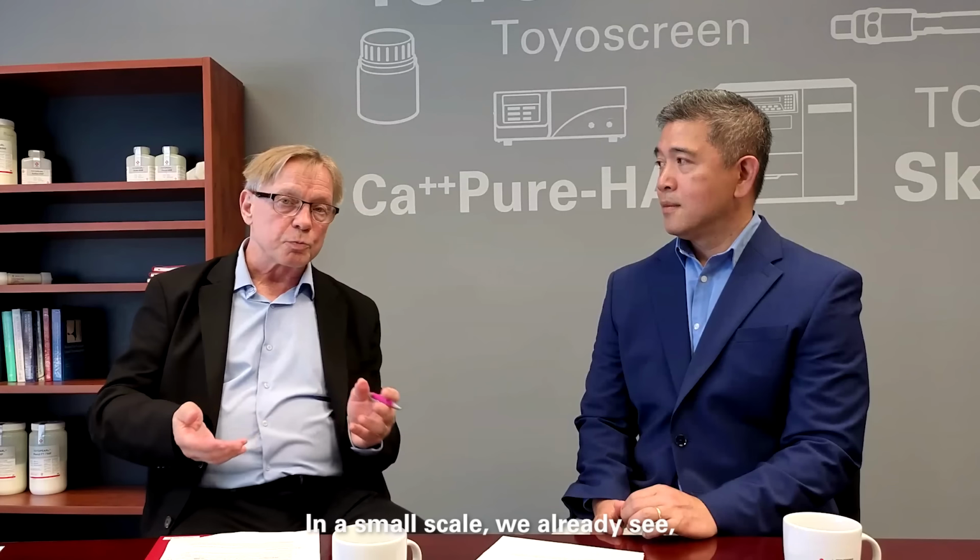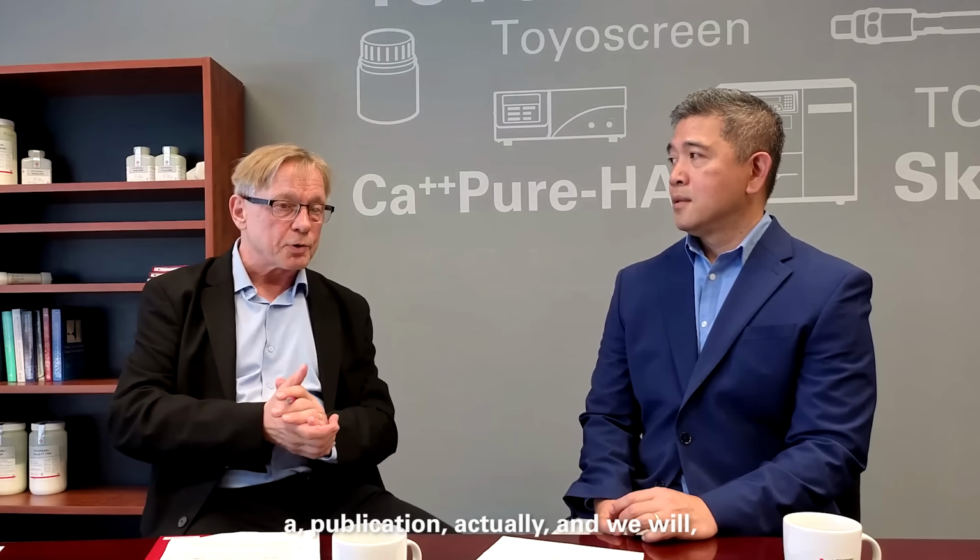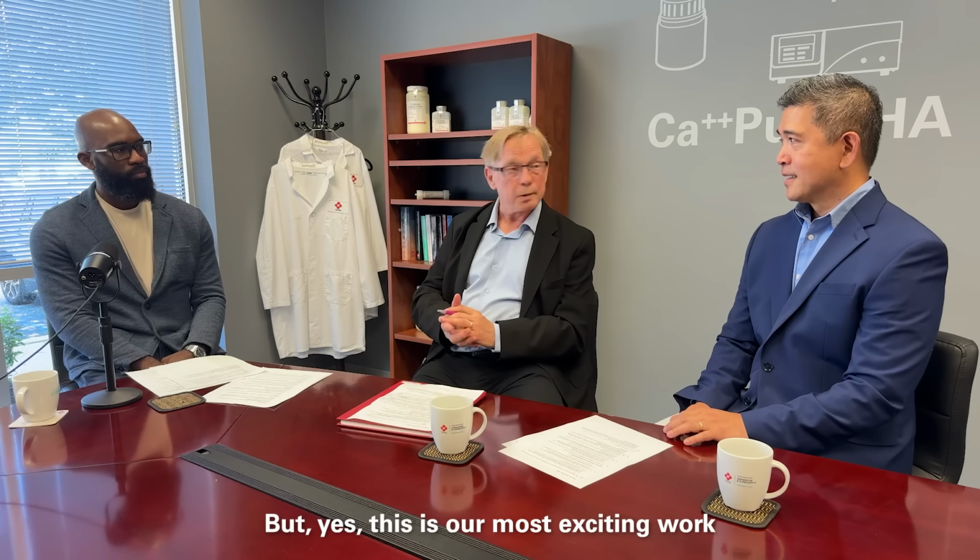And on a small scale, we already see around 90% full capsid enrichment in the process. I can tell you that we already have a publication, and it will come out very soon, and that publication reveals all the details. But yes, this is our most exciting work.